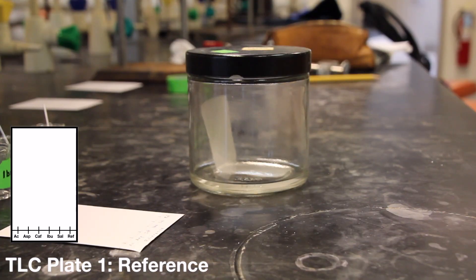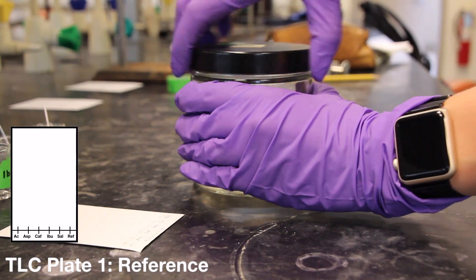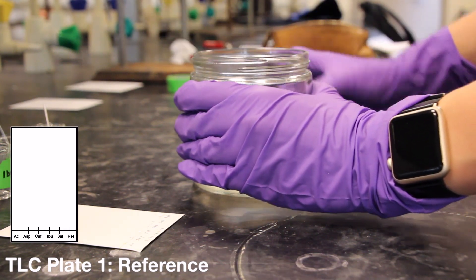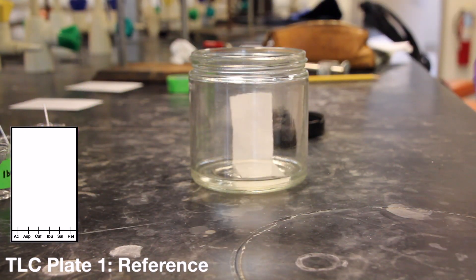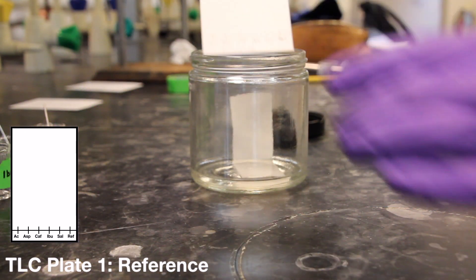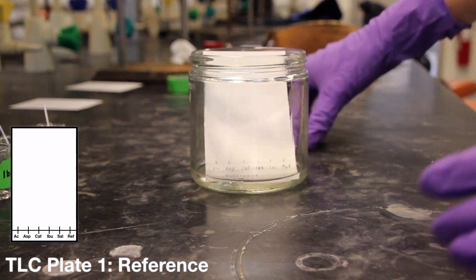Once your first plate has been spotted, place it into the jar with the spotted edge at the bottom. This plate should be placed in the jar with the coated side facing away from the solvent saturation strip. Make sure that the entire bottom edge of the plate is submerged in the solvent, but the line of applied samples is above the solvent level in the bottom of the jar.